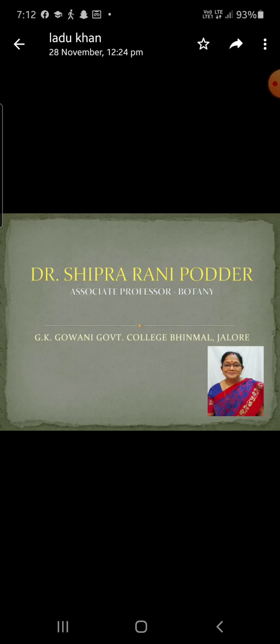The outermost layer forms a one-cell-thick epidermis which is covered by a thick layer of cuticle. The upper epidermis is continuous whereas the lower epidermis is interrupted by sunken haplocheilic stomata which are confined to the wing. The epidermis is followed by a layer of sclerenchymatous hypodermis.